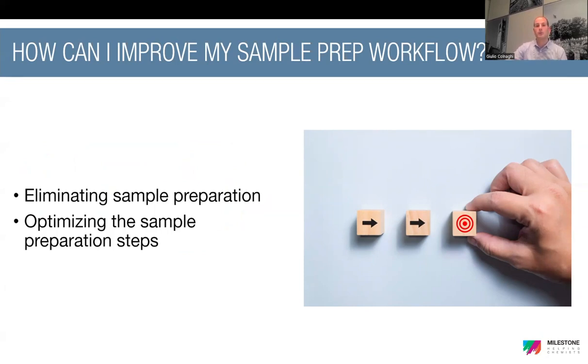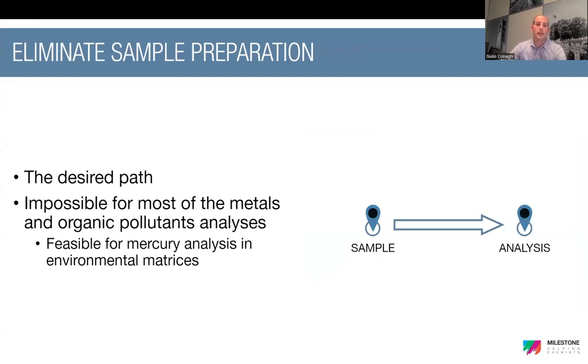But the second option is to optimize all the sample preparation steps and make a smoother transition from sample to the analysis. Eliminating the sample preparation is clearly not feasible for several analyses and for several solid samples.